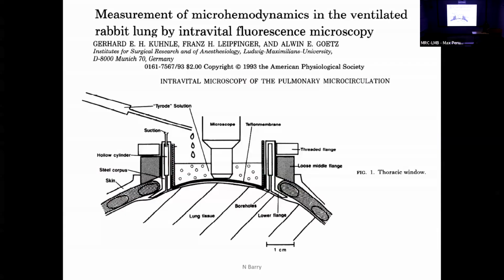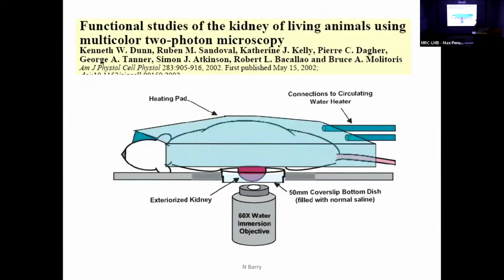You can get into the lungs if you're prepared to do fiddly surgery. You can externalize the kidney and look at what's going on in the kidney. So this was a very interesting experiment because it resolved a discussion about where albumin was filtered in the kidney.